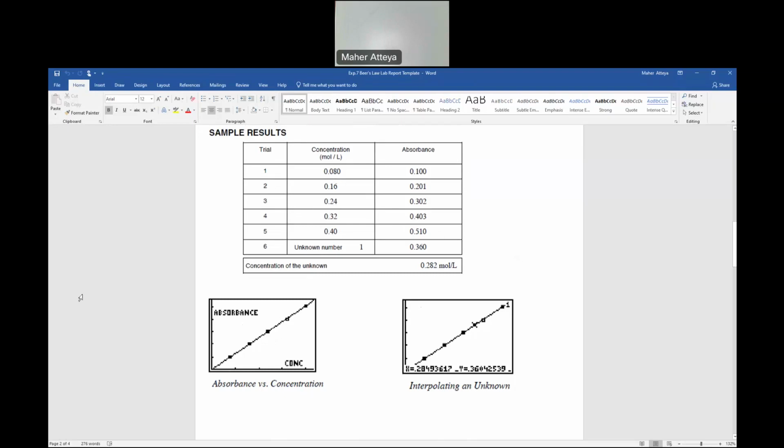I'll be suspicious. This value is from the manufacturer, not mine. This is the same box you have here, the spectrophotometer. It gives you these concentrations, which resemble our concentrations, correct? So we will do all those 5. This is their Excel. They did not use Excel. They use the software itself.